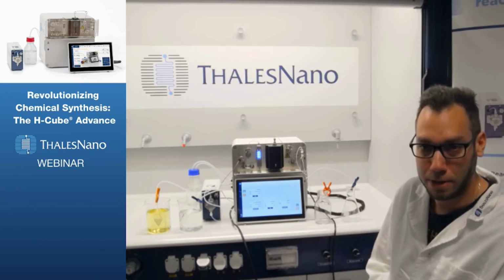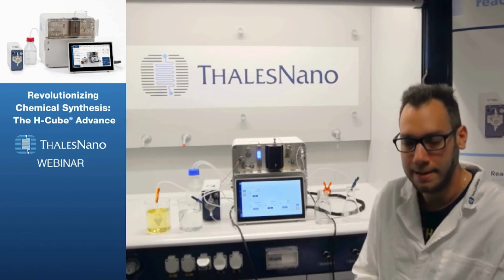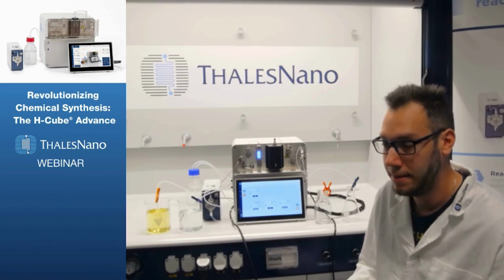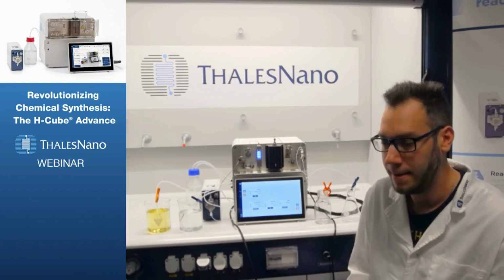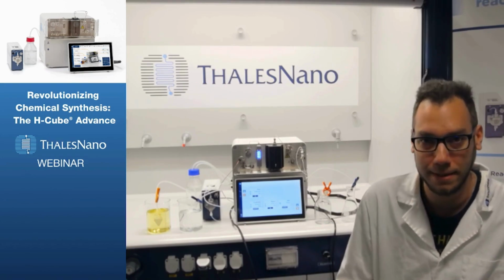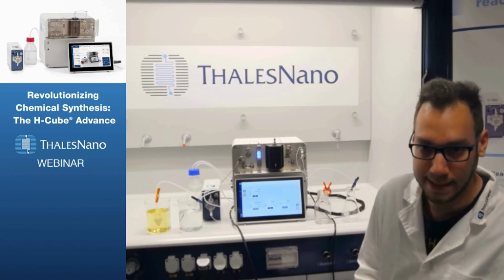I'm in the manual operation mode. I've got the solvent side selected, because I want to start off by injecting clean solvent into the system. That's good for the activation of the catalyst. If you add hydrogen gas to it, that's often a common trick that we teach to our customers: do an activation cycle or an activation period before the experiment. If you pass clean solvent plus hydrogen mixture for 10 minutes through the cat cart, that will allow the activation of the catalyst, and it is very good for the catalyst lifetime, and it allows you to achieve a lot more yield and conversion.